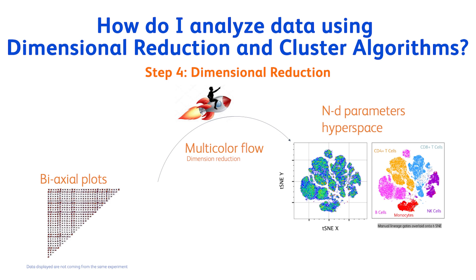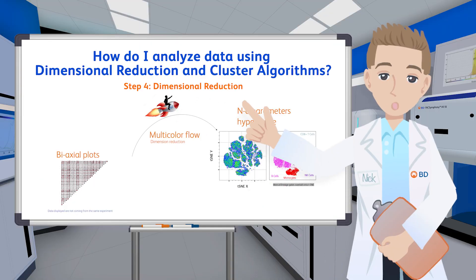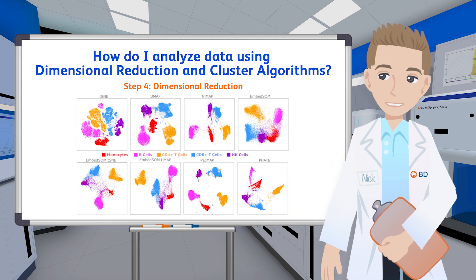Now that our sample is cleaned up and concatenated, it's time for dimensional reduction. The goal of dimensional reduction is to easily visualize our multi-parameter data in a single two-dimensional plot while preserving the overall structure of the data as much as possible. Events with a similar multi-dimensional expression pattern are grouped together within the dimensionally reduced data space.